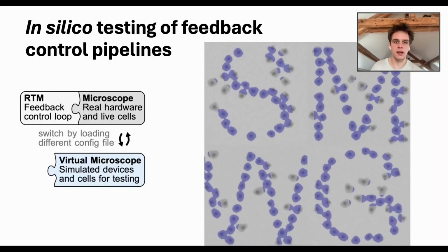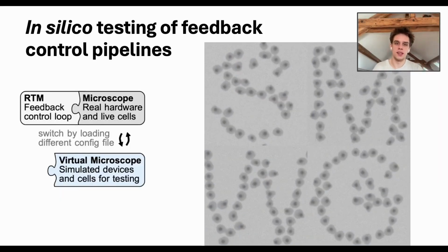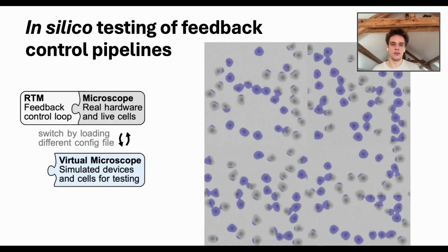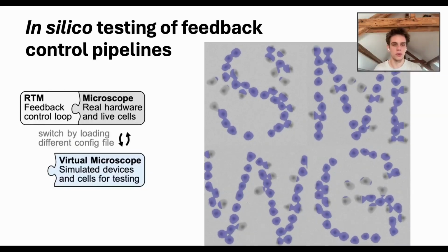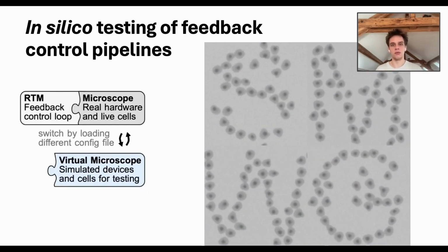And something that was really unexpected is that having this kind of simulation platform, which of course is not biologically accurate, and we don't follow physical models here. It's really just coded together so that it looks and behaves in a way that we would expect from our sample. But it's really not physically accurate. Still, it was good enough that we can actually fine-tune these stimulation rules.